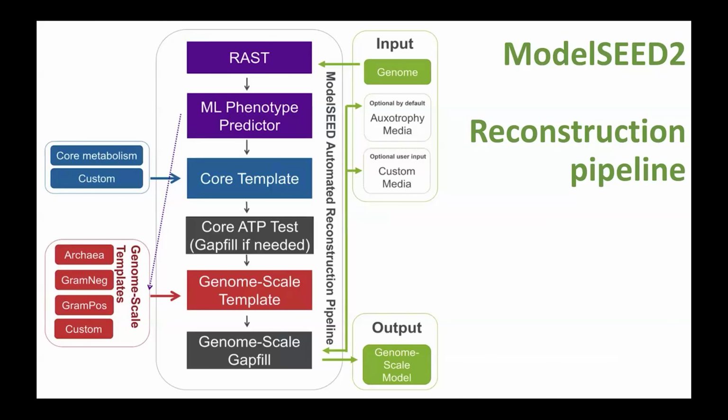And the last thing here on the slides before we jump to the narrative, I just want to give you a little primer talking about the ModelSEED2 reconstruction pipeline.